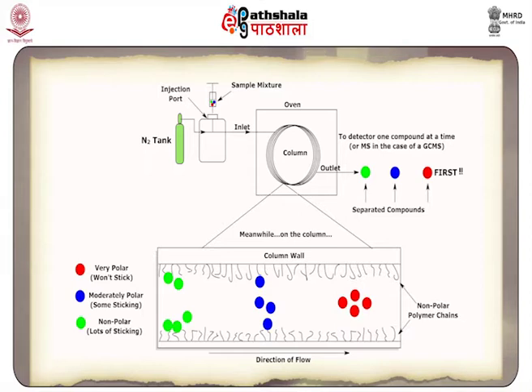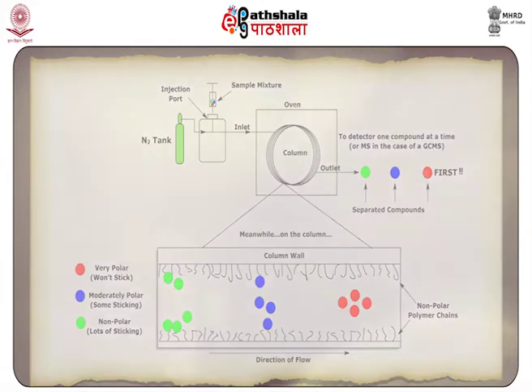It helps in identifying the nature and type of substance, which helps in linking the criminal with the crime scene. Gas chromatography mass spectrometry is a popular method for analysis of ignitable liquids in arson cases.